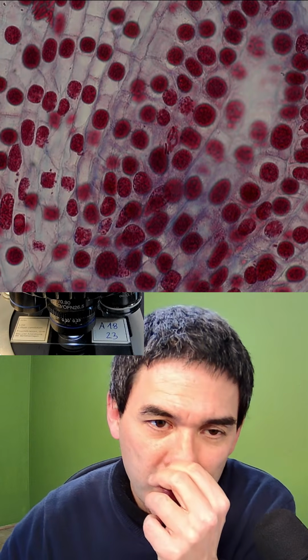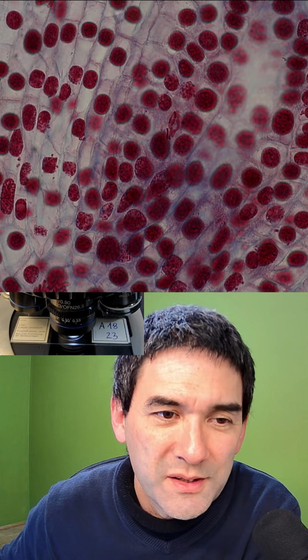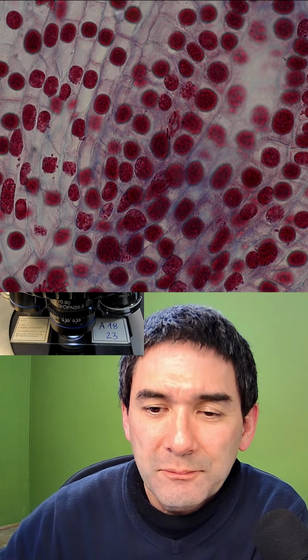So that's the one reason why I like this specimen here, is because you can actually see cells dividing here. Here are chromosomes. This one is in so-called anaphase. The chromosomes have already separated. This one down here seems to be in prophase. So essentially, yeah.